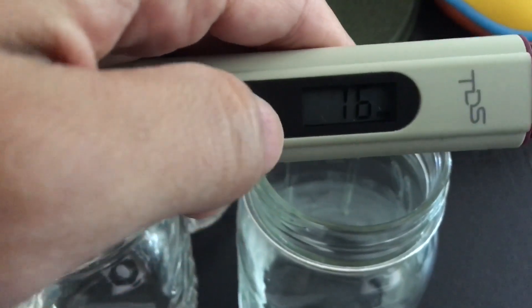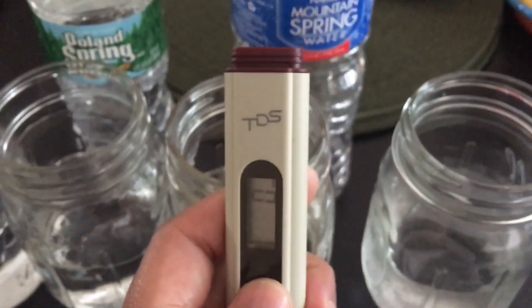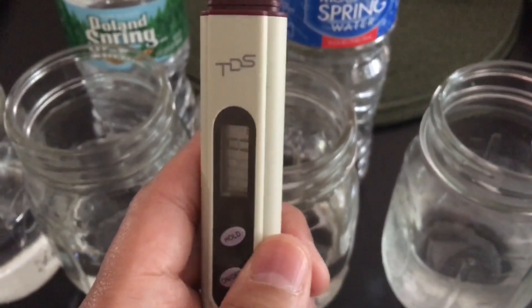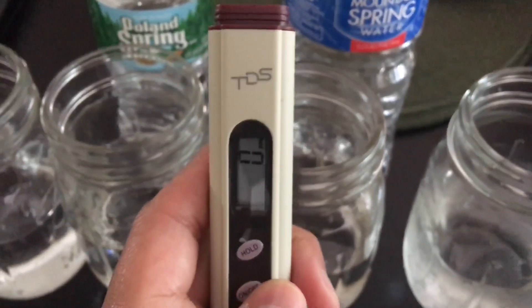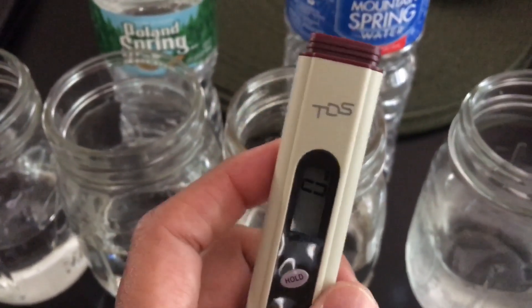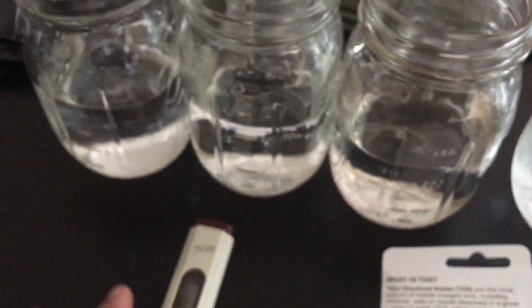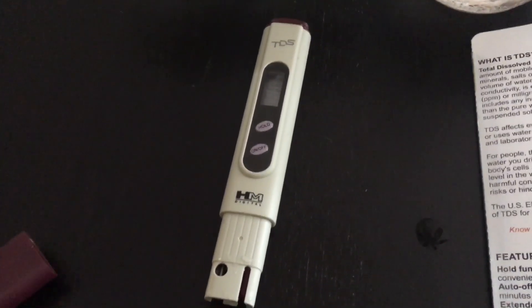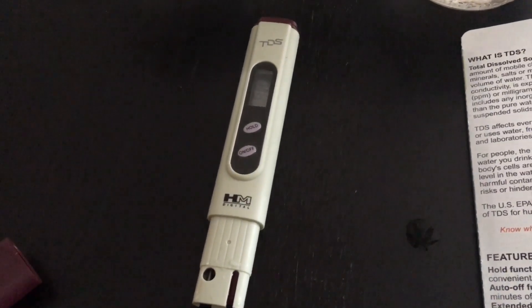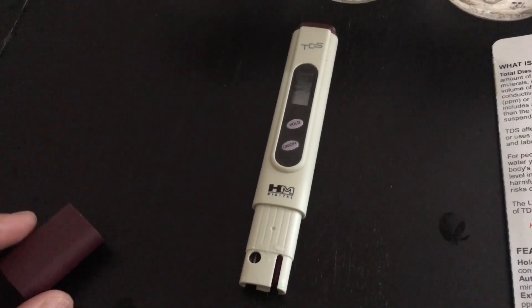With this TDS meter you can see how easy it is to test and ensure you're getting good water quality. If you already have an RO filter, you want to make sure you get as close to zero as possible — the higher the parts per million, the more it's an indicator that you need to change your filter. It's a great, easy meter to have around, and definitely if you're in the reef tank hobby, it's a wise investment alongside your other test kits to ensure you're getting the water quality you want and good value for the money.